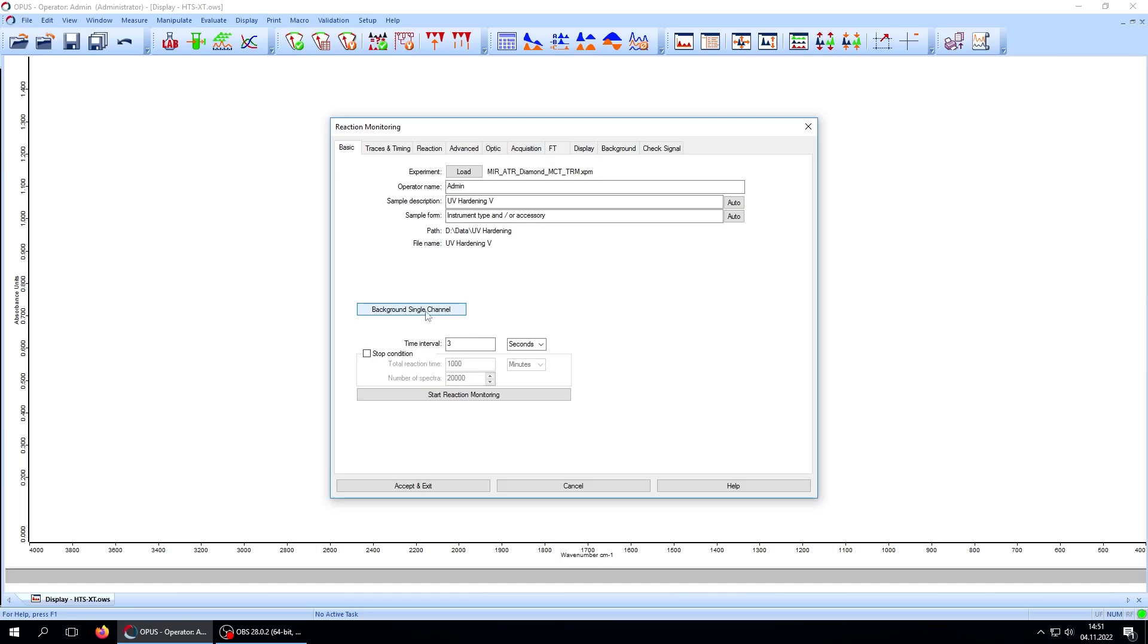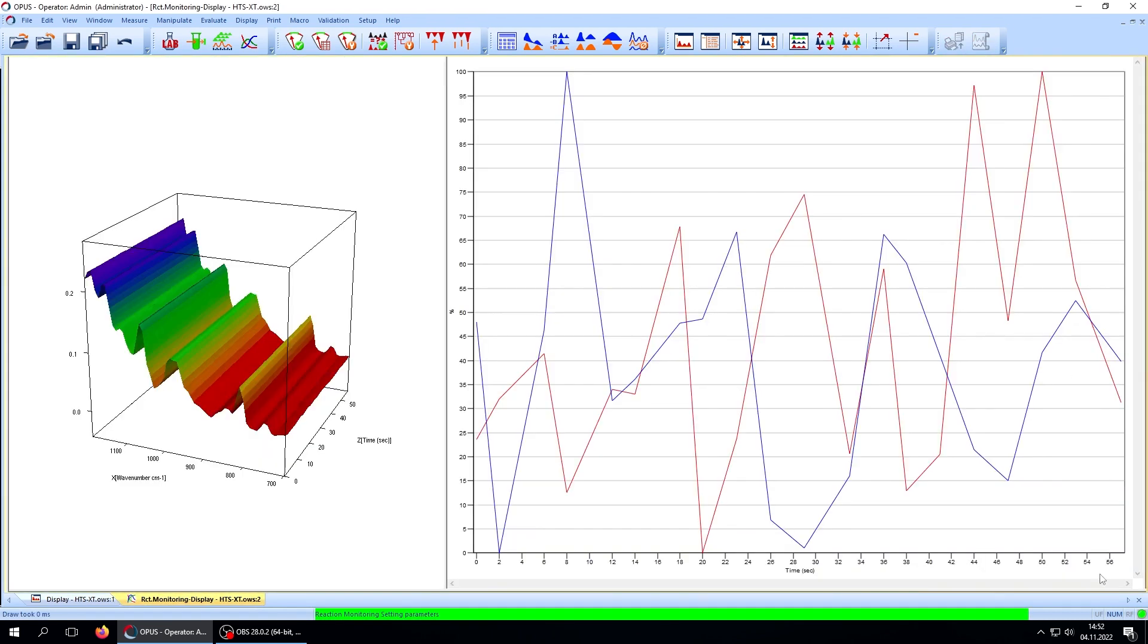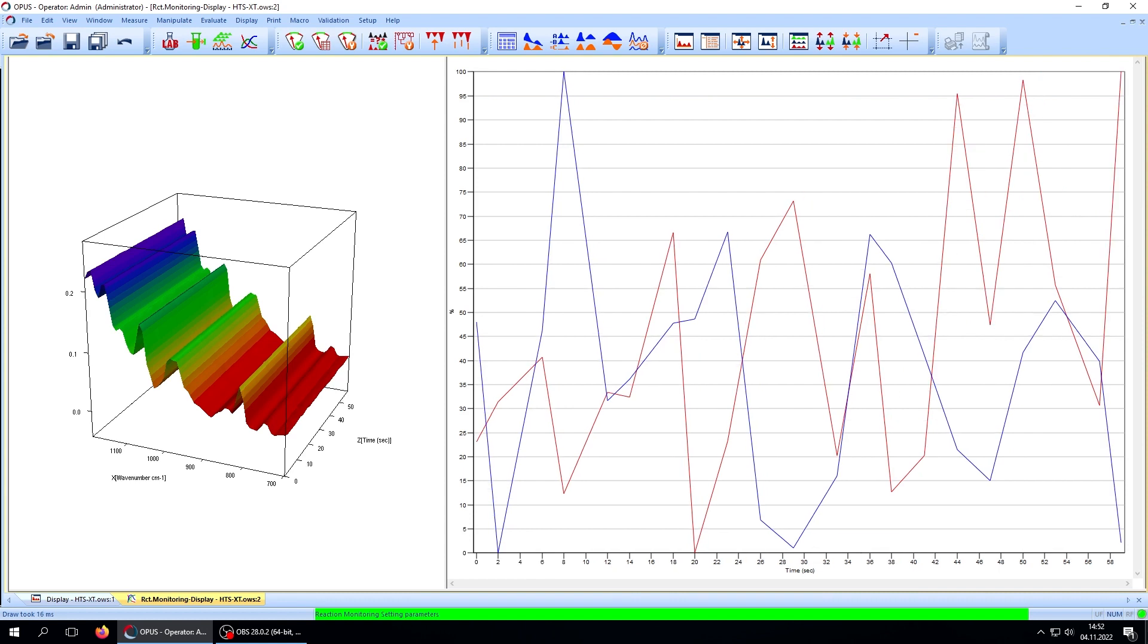No polymerization takes place until the UV lamp is switched on. Therefore, we do not see any changes in the contributions of the selected functional groups over time. Or in other words, the spectrum of the adhesive is constant.